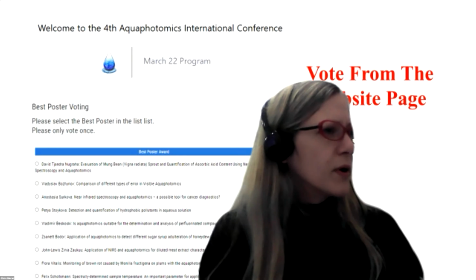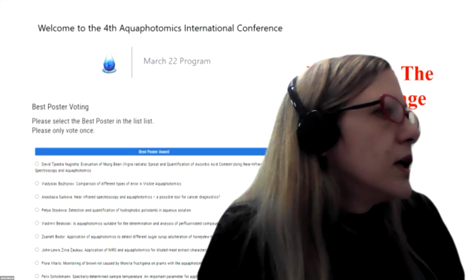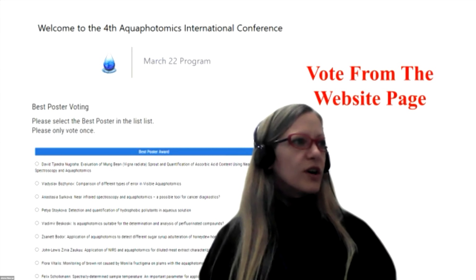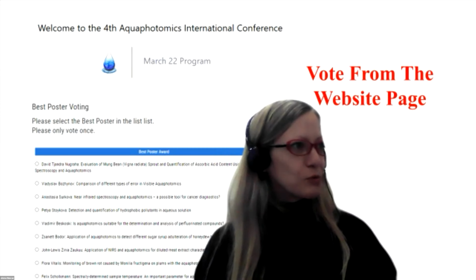Do you use something like thermal analysis methods for investigation of polymers? No, not yet. It's not that I think it's necessary. I just think that those kinds of destructive methods can be replaced by the methods that you are showing. Okay, thank you. I think that would be highly useful. I will do it.